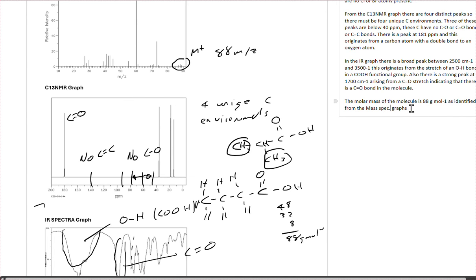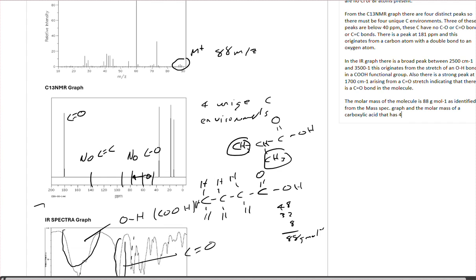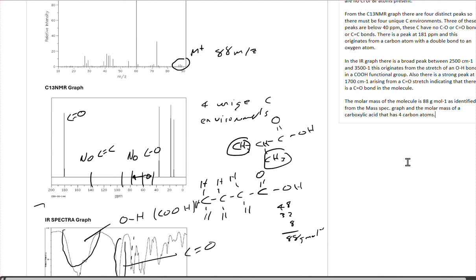As indicated by the mass spec graph, and from the molar mass of the proposed molecule, a carboxylic acid that has 4 carbon atoms. So I've got evidence down here at the bottom that we've actually calculated that.